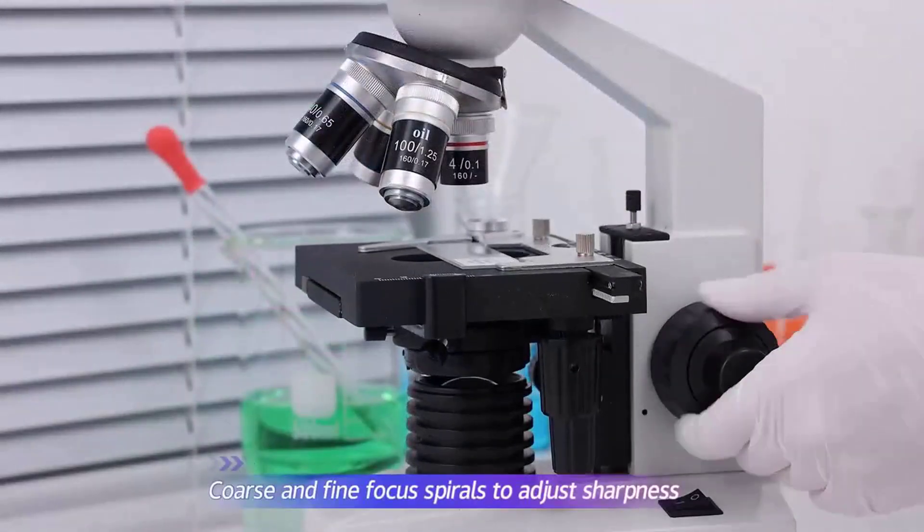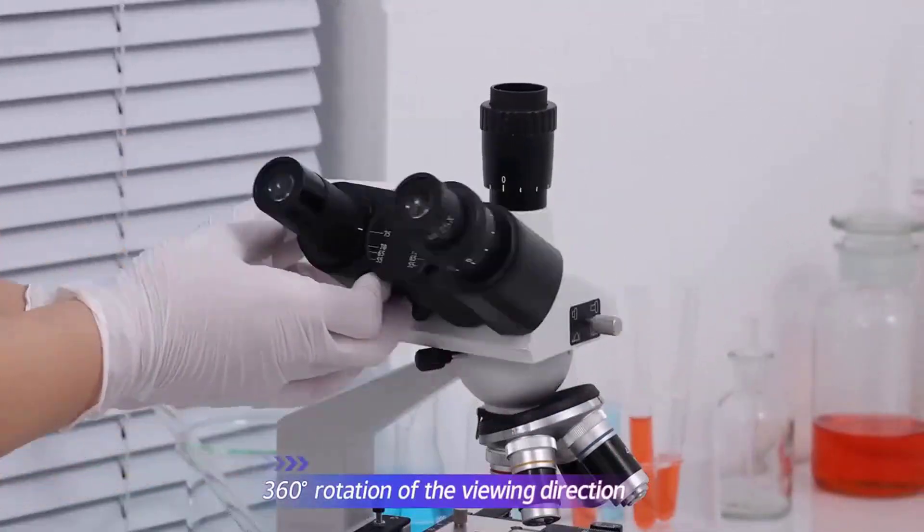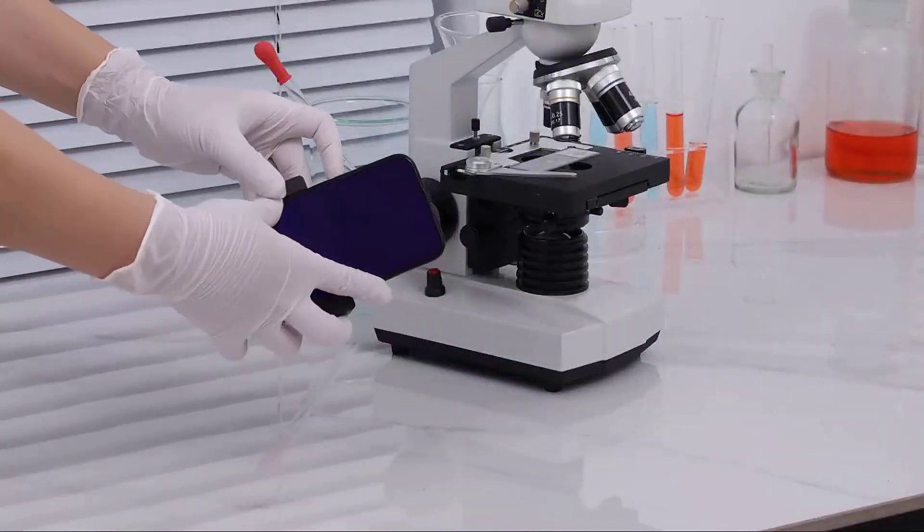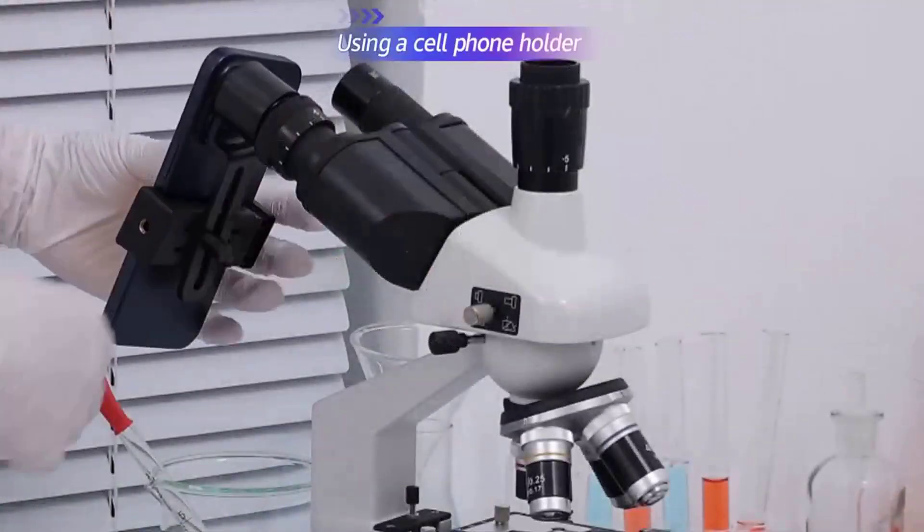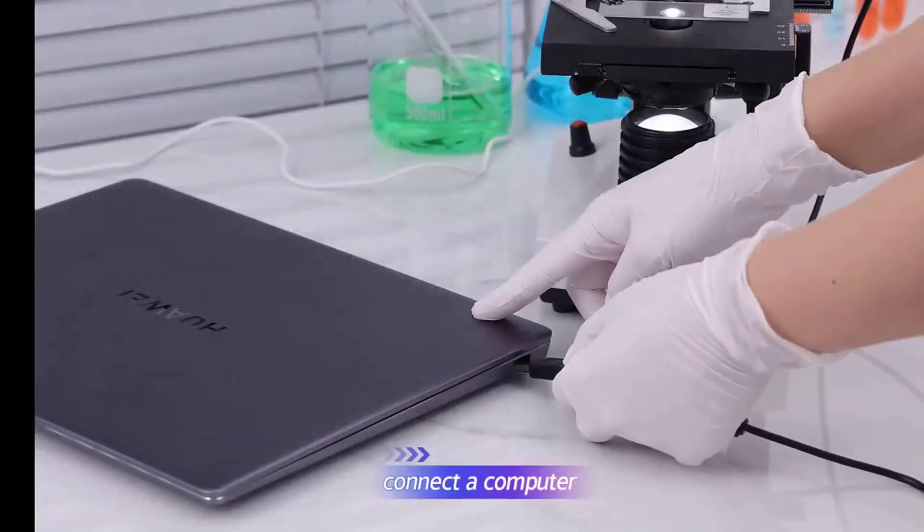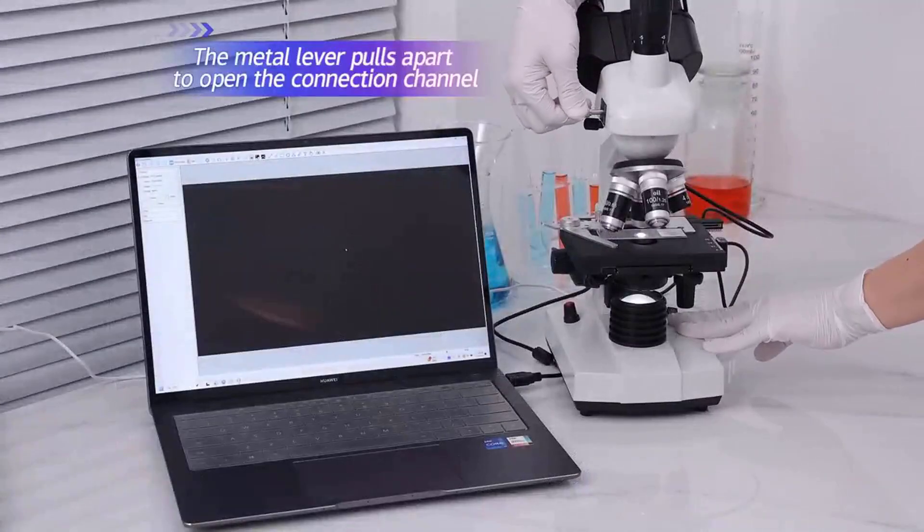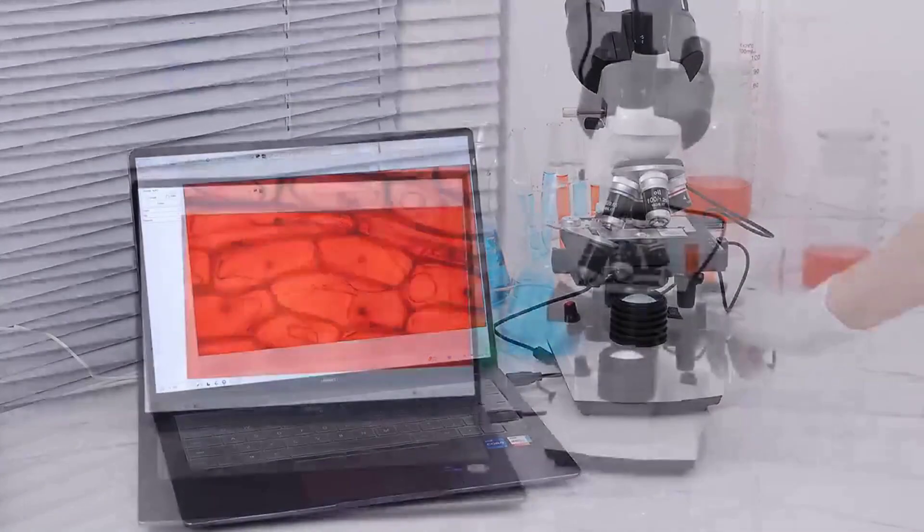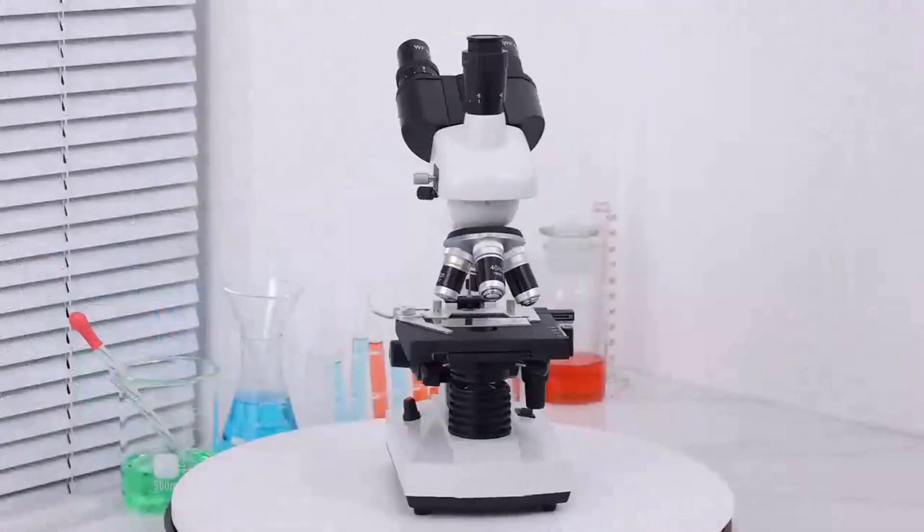Extended viewing sessions remain comfortable thanks to thoughtful design elements. The ergonomic wide-angle eyepieces minimize fatigue, accommodating users with or without glasses. The sophisticated LED illumination system adapts perfectly to various specimen types. The initial configuration process presents a slight learning curve. The instruction manual lacks clarity, and mastering the focus adjustment requires practice. The robust construction, while ensuring stability, makes it less portable than lighter alternatives like the Amscope M150.